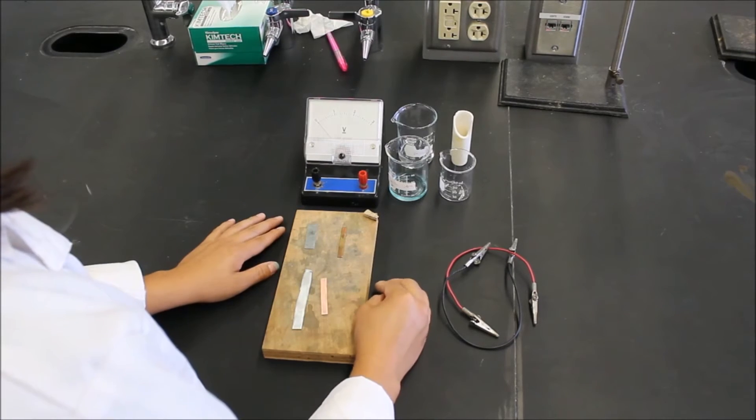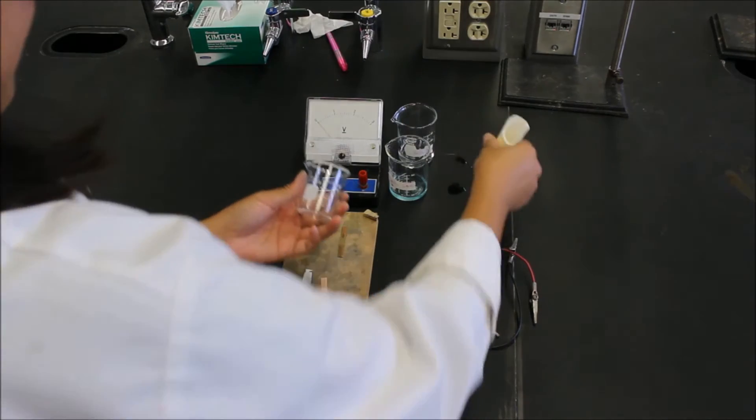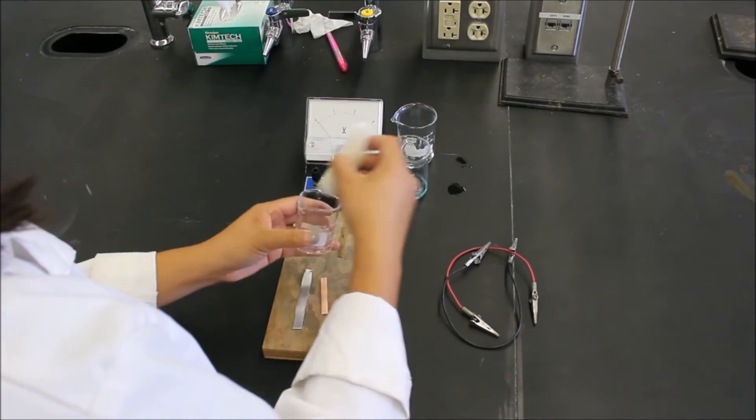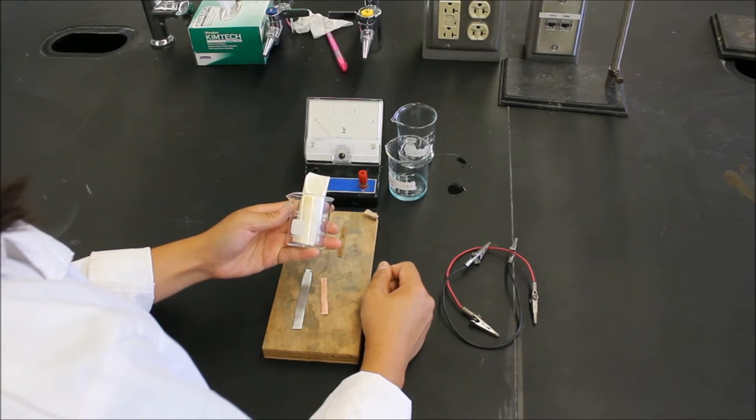So after these are polished, you're going to want to set up your cell. What you'll need is the beaker, 50 milliliters is fine, and the porous cup, which just goes inside. And that's our galvanic cell that we'll be using for this experiment.